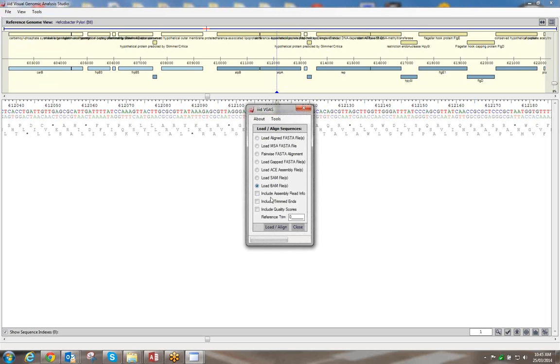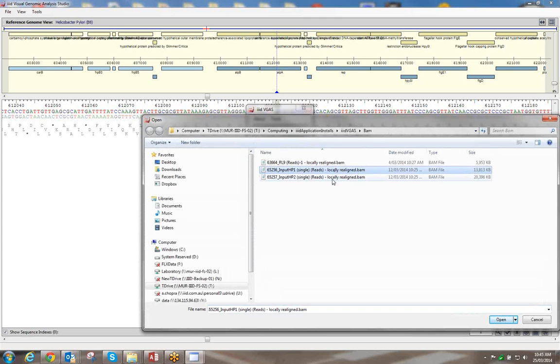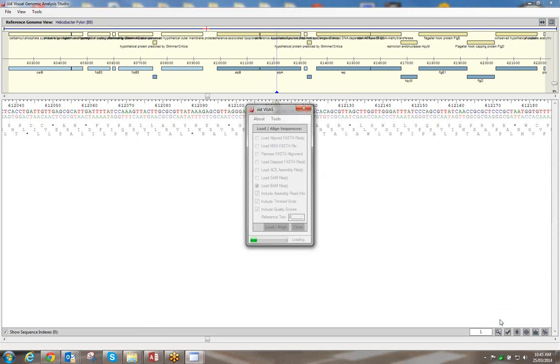Now we're loading two different BAM files to show how to do group differences. This takes a little bit of time. You need a computer with quite a bit of memory — doing it on a big computer like the one in Simon's room will be useful, as this probably won't work well on a desktop computer. Loading 12 samples typically takes about 8 minutes and uses about 16 gigabytes of memory.